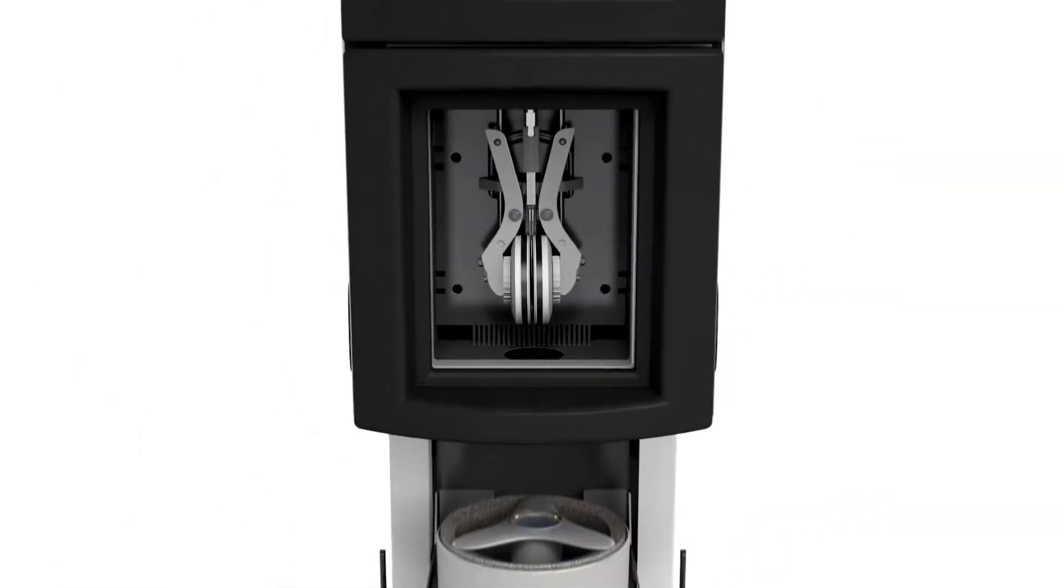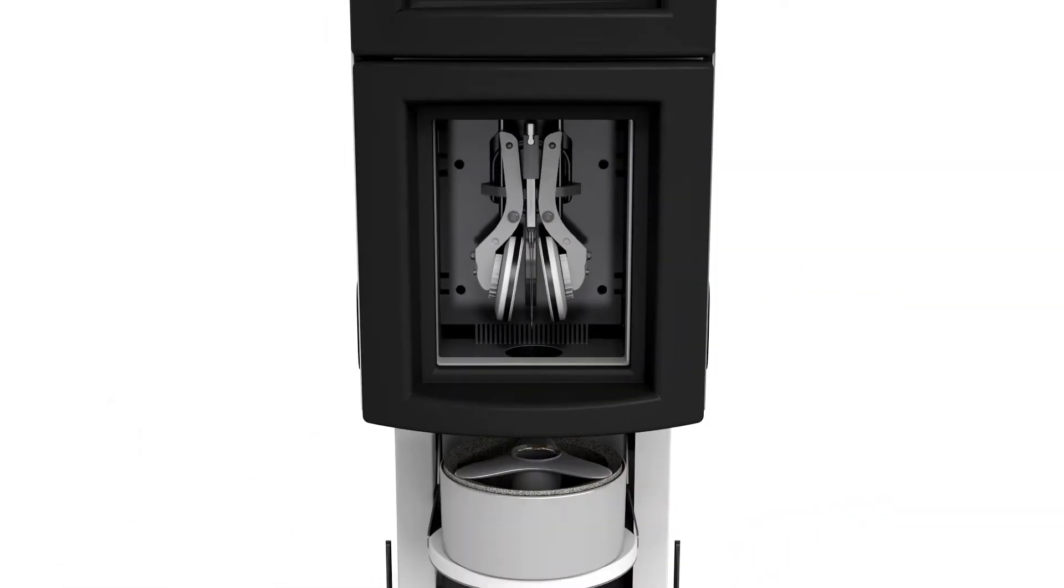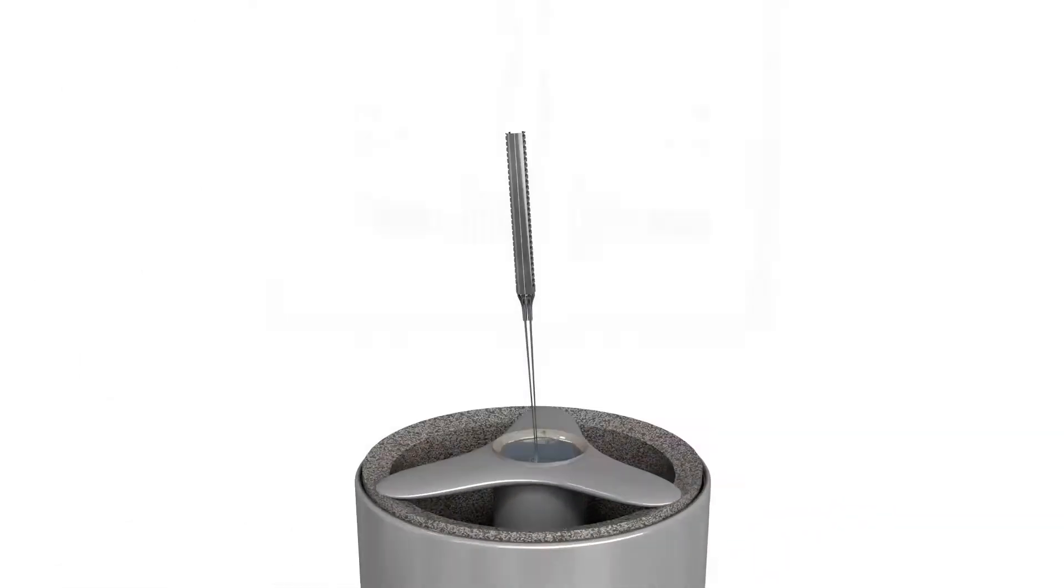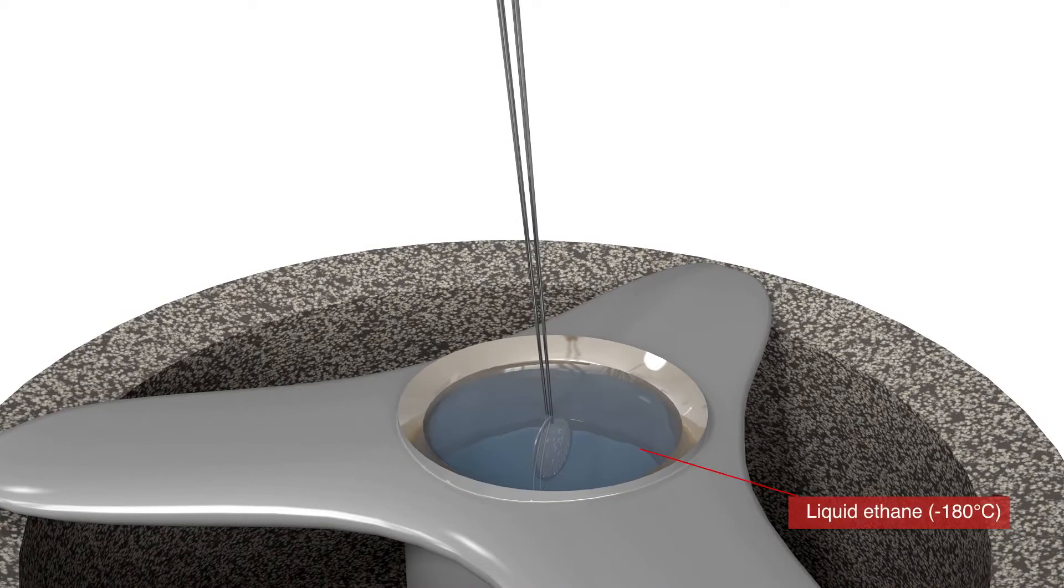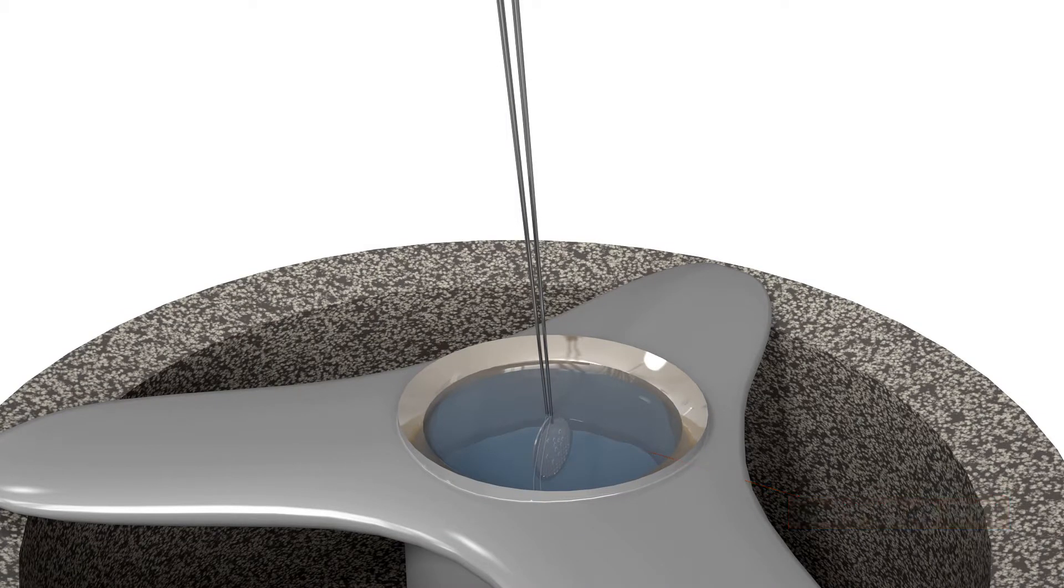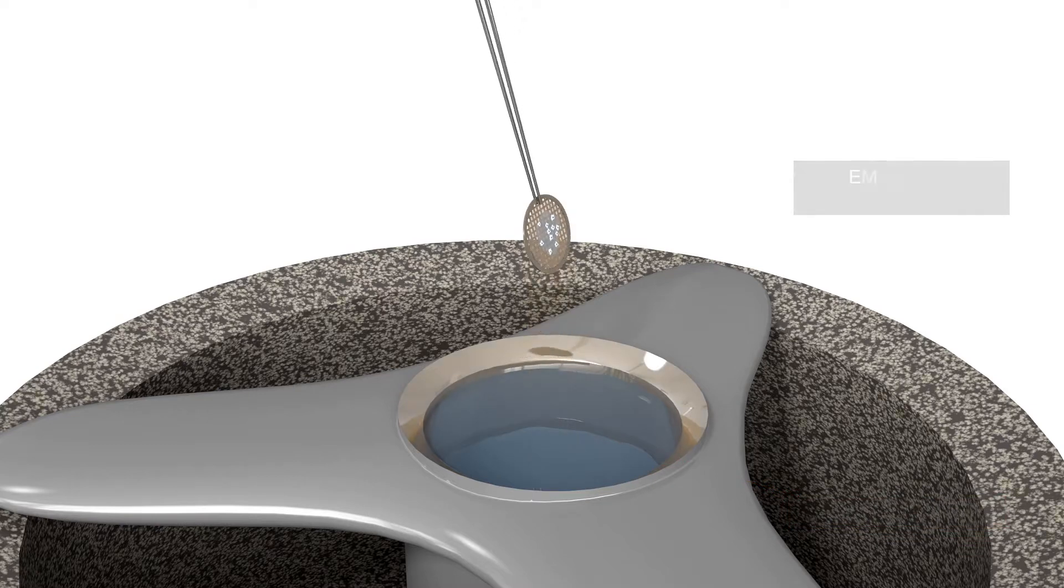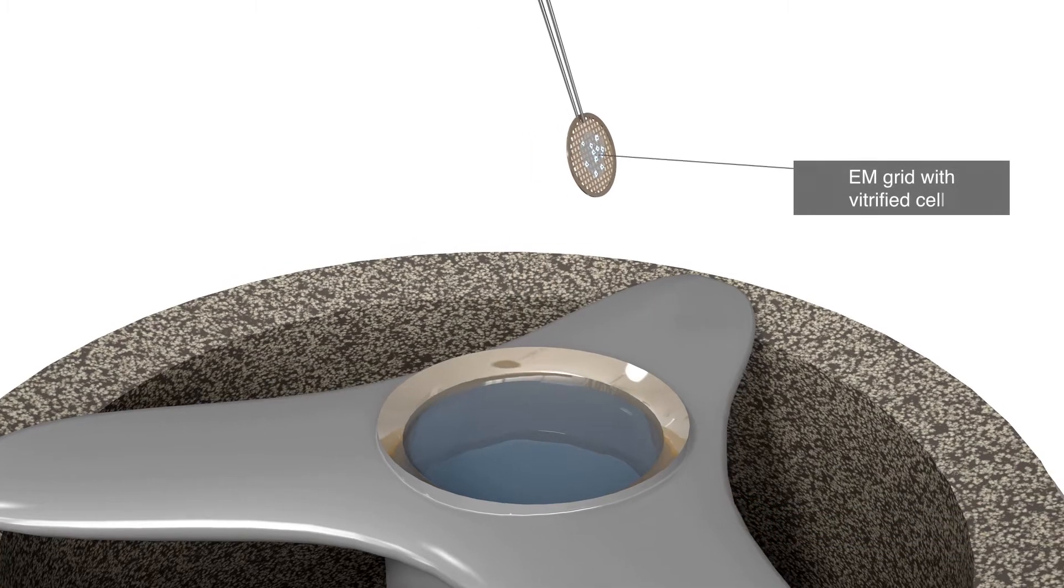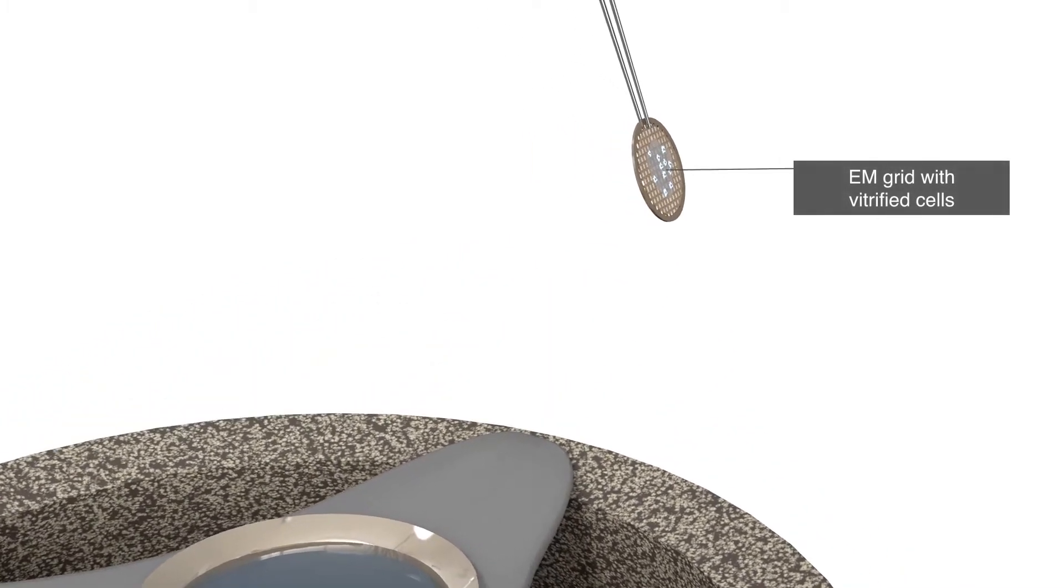Immediately after, the cells are automatically immersed in liquid ethane at minus 180 degrees Celsius. The flash frozen cells are now vitrified and the EM grid is transferred to the cryofib.